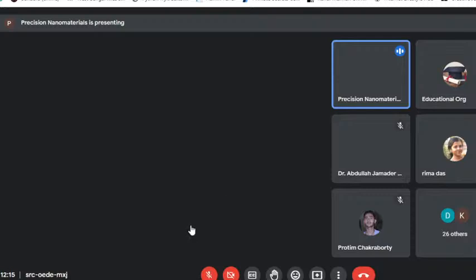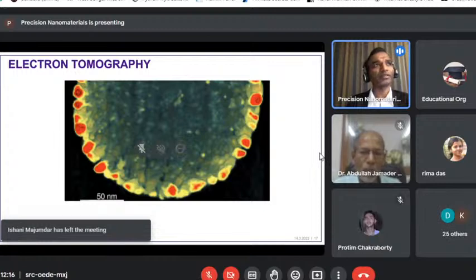and then you can color them artificially. Here red means strong, red means high contrast, something like that. And then you also have low contrast elements, organic. In this case, a nanoparticle coated with the peptide. And you can also do a cross section and you can identify individual nanoparticle location. You also get an idea how it looks like. So essentially tomography or 3D electron microscopy is a combination of imaging and image processing technique.